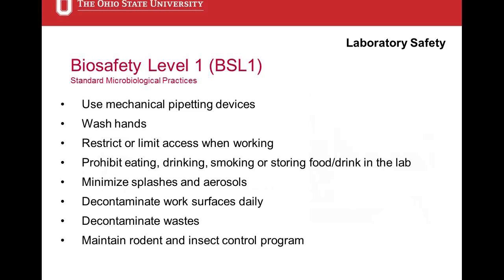Wash your hands. Hand washing is very important in the transmission of disease, or preventing transmission of disease. So anytime you remove your PPE, you should wash your hands. You should restrict or limit access when you're working in the lab. We don't just want anybody walking into the lab when you're working. Prohibit eating, drinking, smoking, or storing food or drink in the lab.